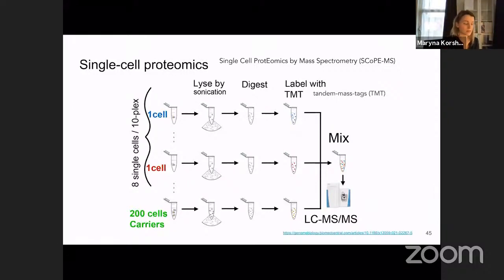However, because the sample preparation is quite complicated and the amount of biomaterial which you use as a sample is very low, it also promotes a lot of technical bias in data interpretation or other stages, like literally tracking the peaks and discovery of false positive results and so on and so forth.